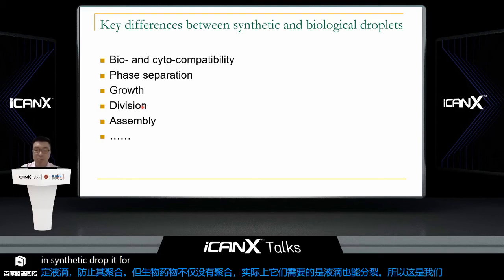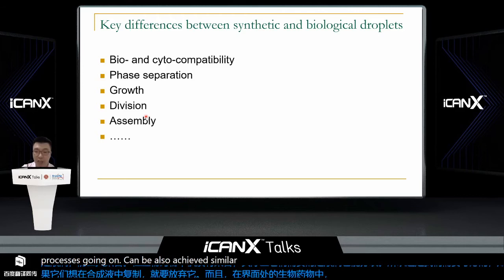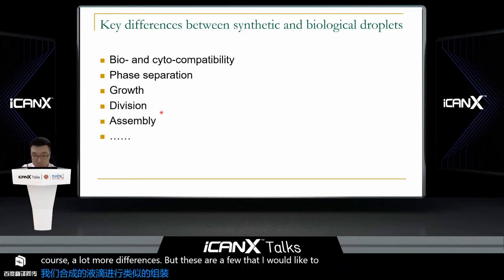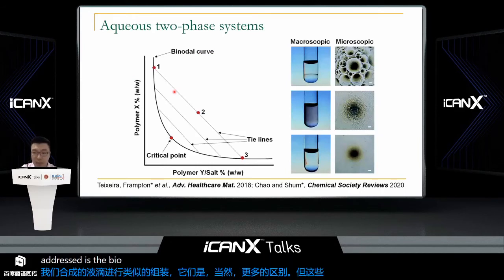Furthermore, in biological droplets, at the interface, there will be a lot of assembly processes going on. Can we also achieve similar assembly with our synthetic aqueous droplets? And there are, of course, a lot more differences, but these are a few that I would like to highlight here today. And so the first point I'll address is the bio and cytocompatibility issue.